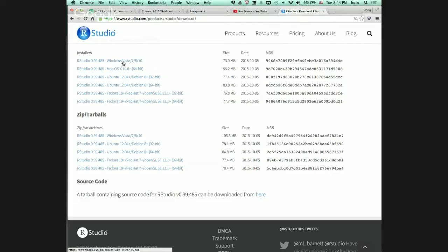If you use one of those Spelman laptops, R is already installed. For the Spelman HP laptop, the software R is already installed, so you don't need to do it. You just need to install RStudio. The second one, that's what you want. This is RStudio, the main one.